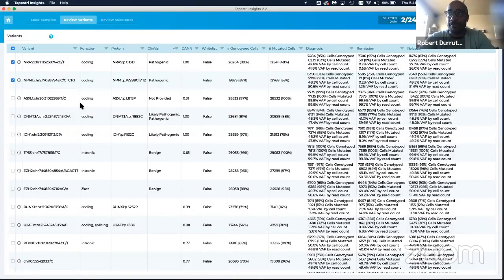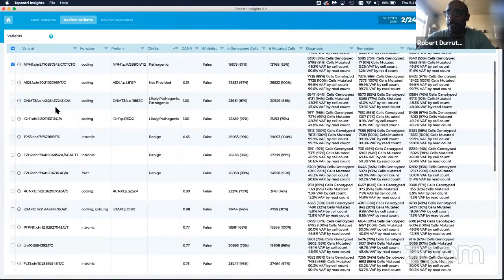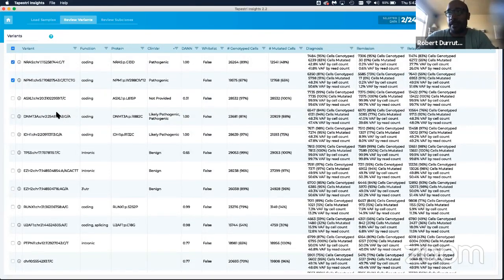If I don't have any knowledge and this is a blinded analysis, I wouldn't include that for my downstream model. If you do select it, it's not going to harm or change the interpretation of your ultimate disease model, because it's not going to change the clonal architecture. As you can see, it's invariant across all cells. But out of experience, I will not include that.